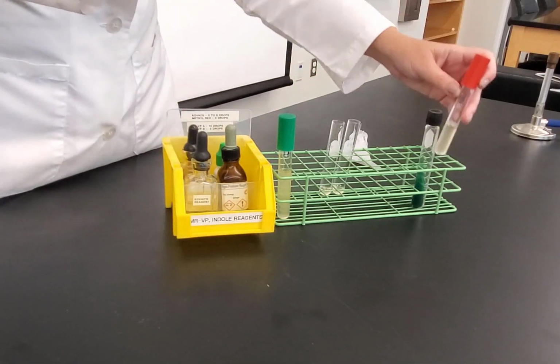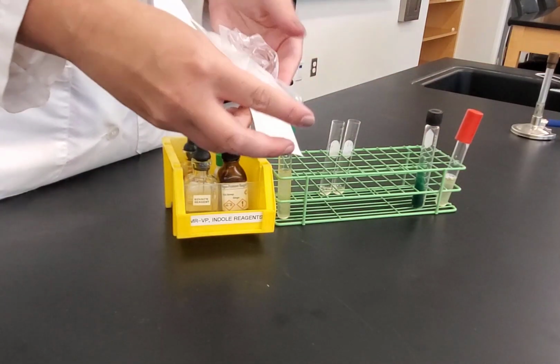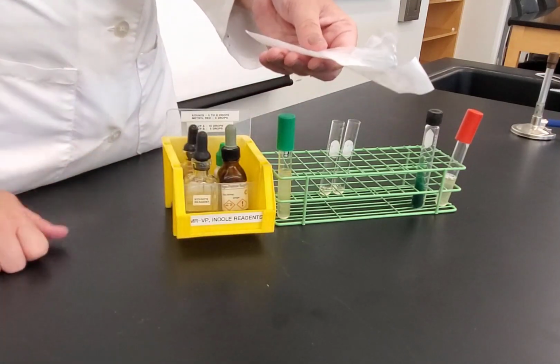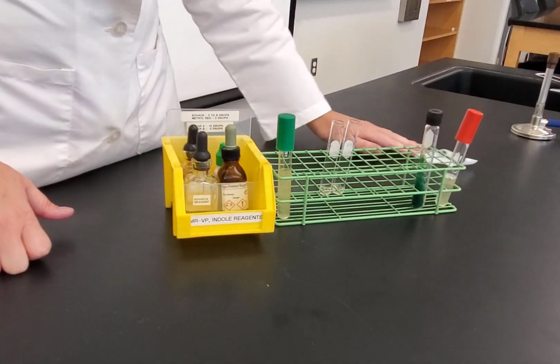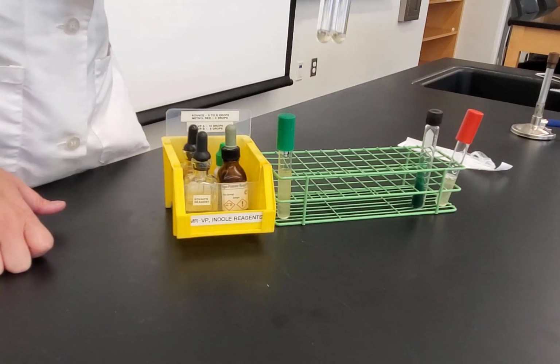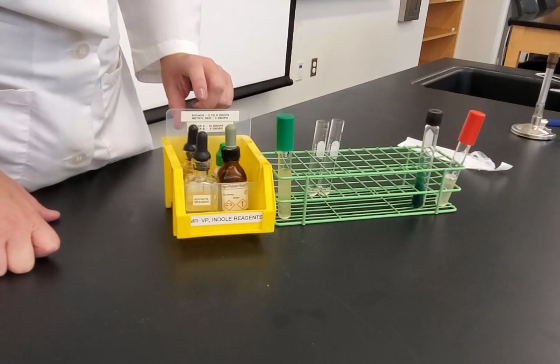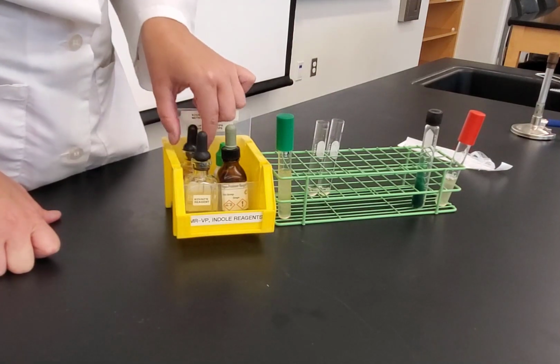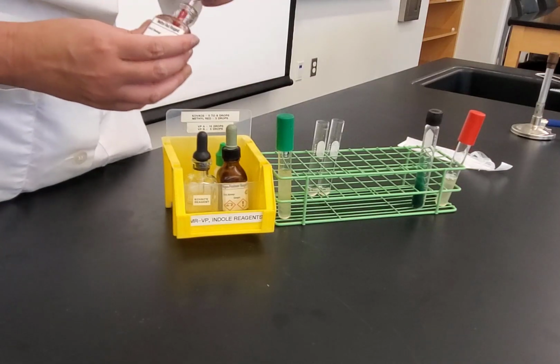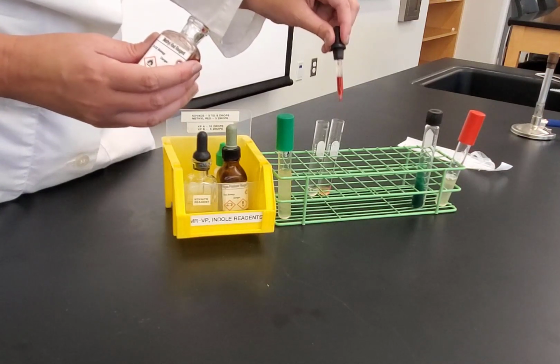So there is some extra broth in there. That's to be expected. We can just put that aside in case we need it. I put the transfer pipette back in the wrapper so that I don't set it on the desk and get bacteria on the desk. So it's in the wrapper. So now I have my 2 tubes. I have my MR and my VP. So to my methyl red tube, I'm going to add 3 drops of the methyl red reagent. So I'm going to take this and 1, 2, 3.